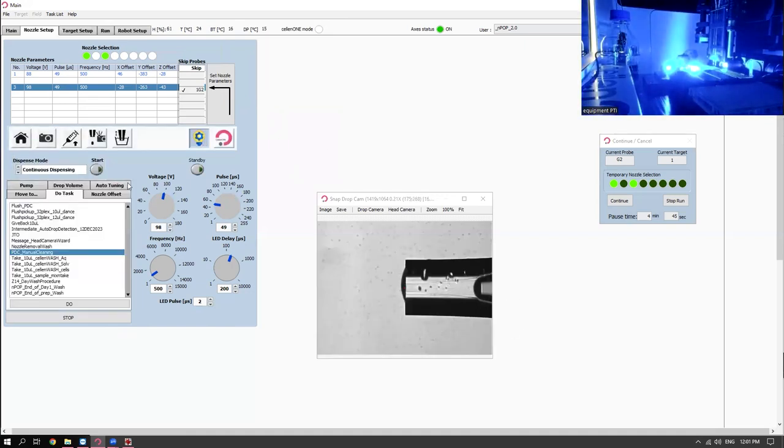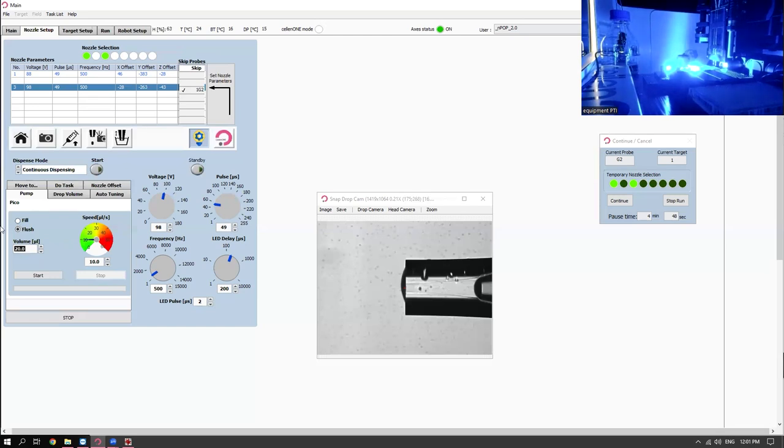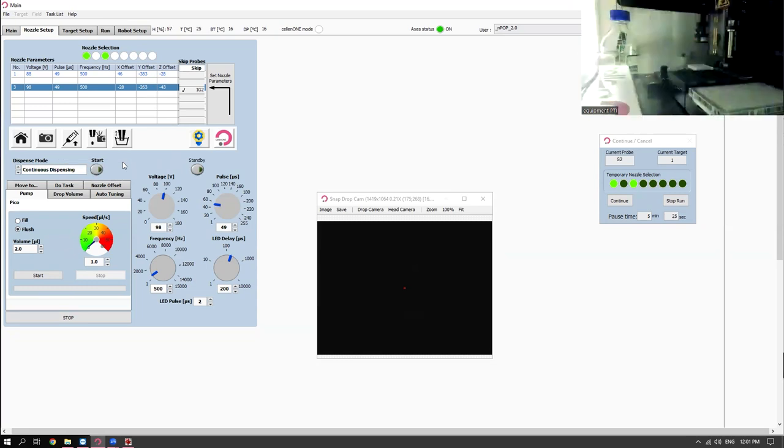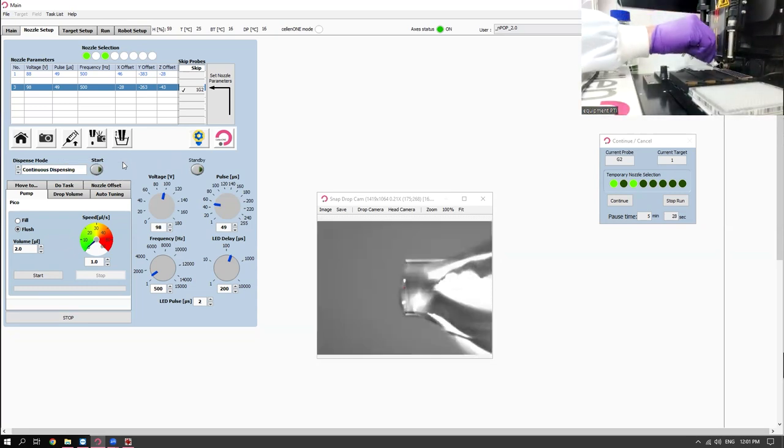We have here this large air bubble. Yeah, I mean, don't do that, guys. So we're going to flush out 2 microliters at a time and see how much we actually took. 2 microliters. Another 2 microliters. Looks like we took about 3 microliters of air. So depending on how you have it set up. So now I have a nice drop again. So we can just go and drive this excess air that's outside the nozzle.